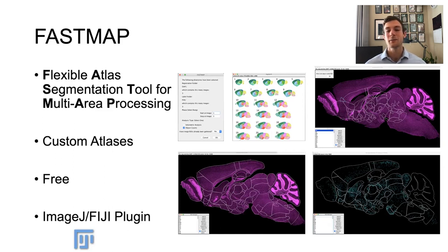The custom atlas plate will then be applied to the image, and one by one, regions will resize themselves linearly to better align with the target. Users can then refine the registration manually in a free-form manner to ensure a perfect registration. Once satisfied with the alignment, the registration is then applied to the imaging channel containing the labels of interest.